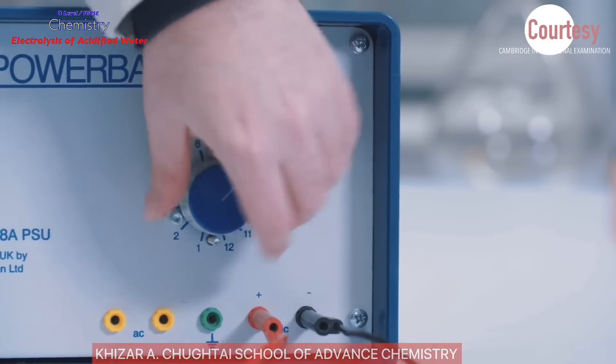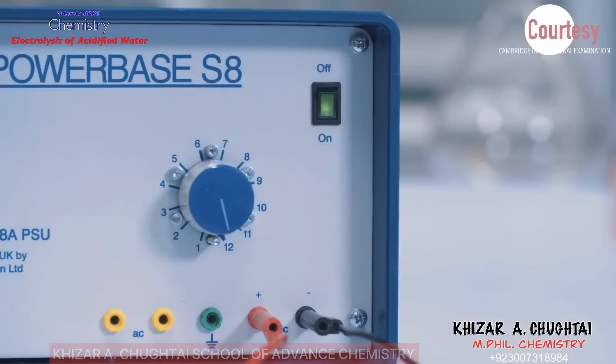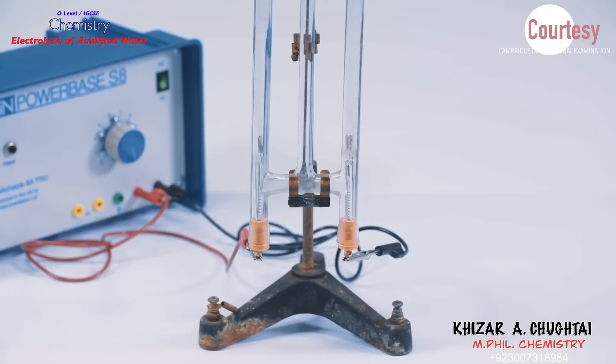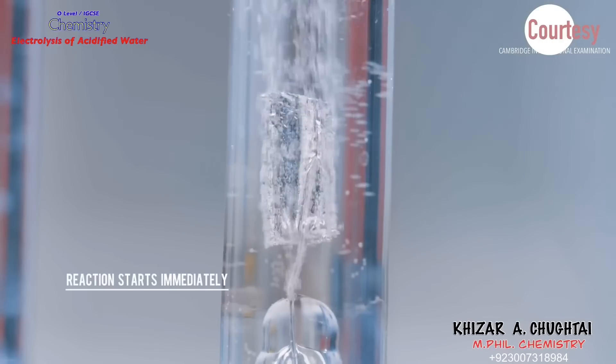DC power supply is adjusted to 12 volts, then switched on. Immediately, bubbles of gas are seen on both electrodes.